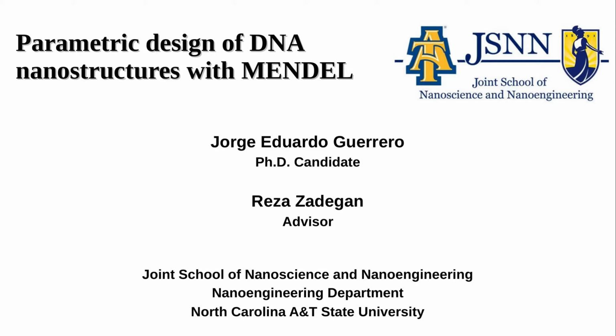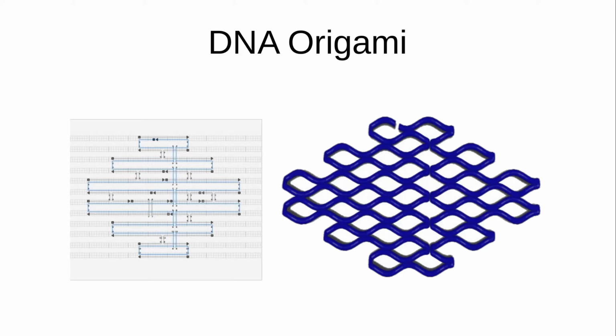I am going to talk about the software tool we developed called MENDEL to automatically design functional DNA nanostructures. The nanostructures are built using the DNA origami technique that consists in the folding of the DNA strands by synthetically creating DNA staples that maintain the scaffold in place.